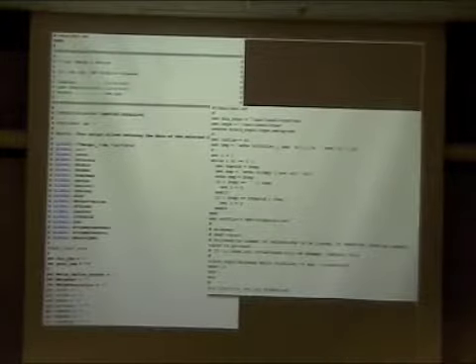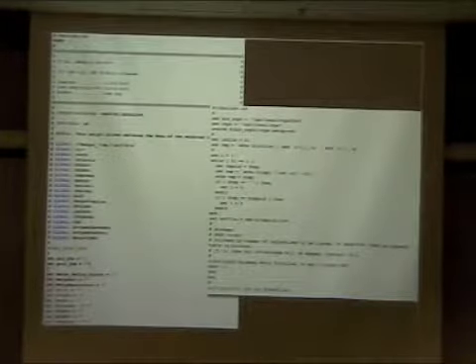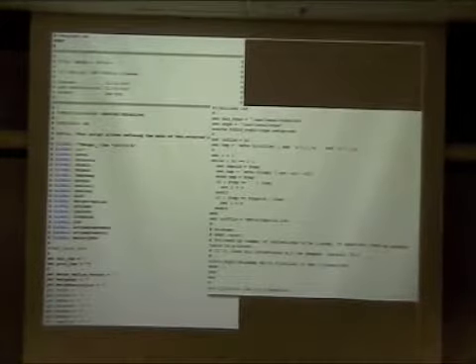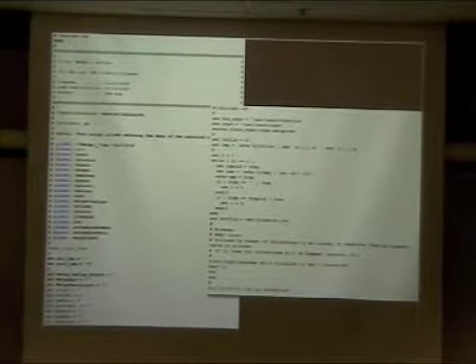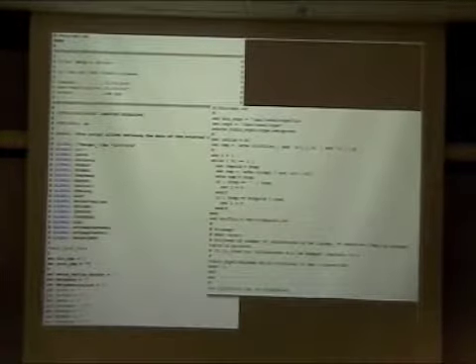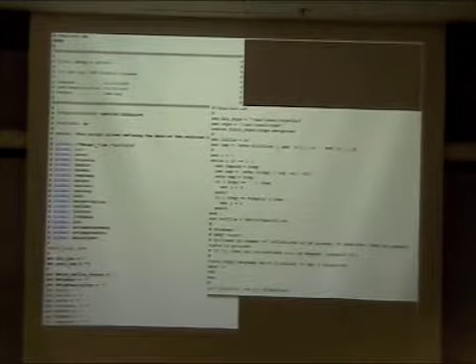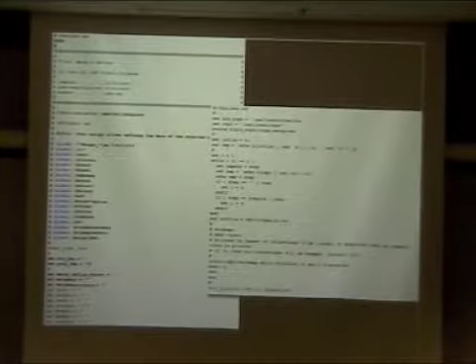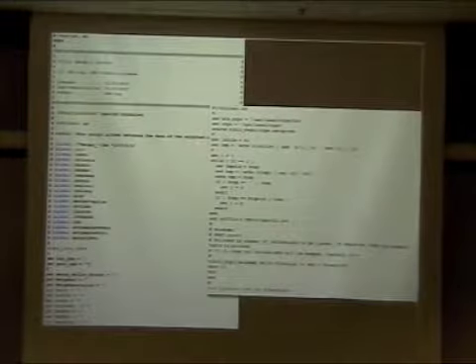That said, most people do have these scripts in their lab, and so the first thing we were finding when we were developing this was, 2DX is great, it looks pretty, but we already have our stuff and it works fine. And I agree. If you've got things that are already fine-tuned for your projects, there's no reason to jump away from that. I know that in the Mitsuoka lab, for instance, Kaoru goes back and redefines the set of scripts for each individual project that he starts. And that's really the right way, in my opinion, to go about things. You really should fine-tune. But that said, we wanted to be able to take advantage of that, and so that's really what we've done. And I'll take you through that a bit here in a moment.